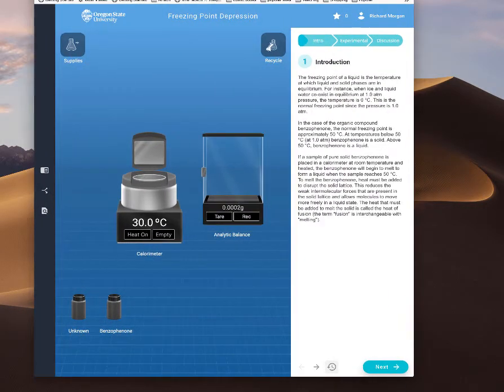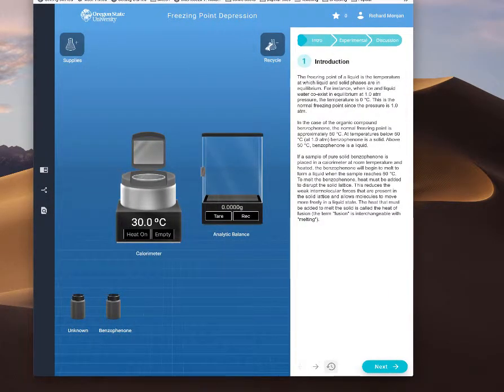Hi students, this is my demonstration for your freezing point depression lab on the Smart Sparrow for Chem 121.